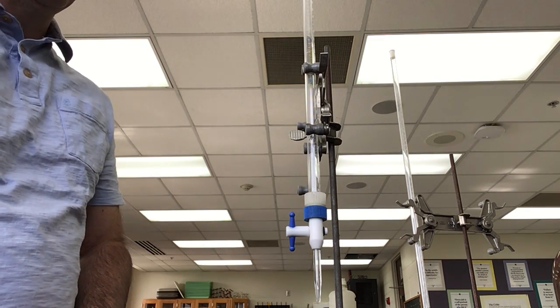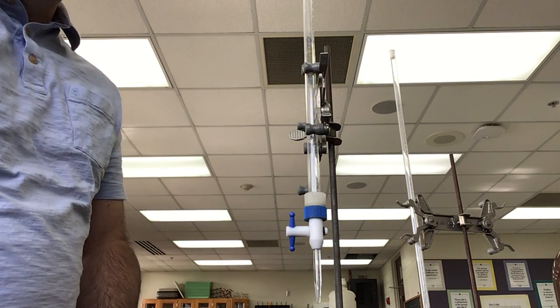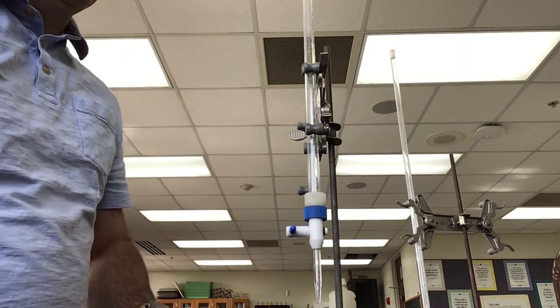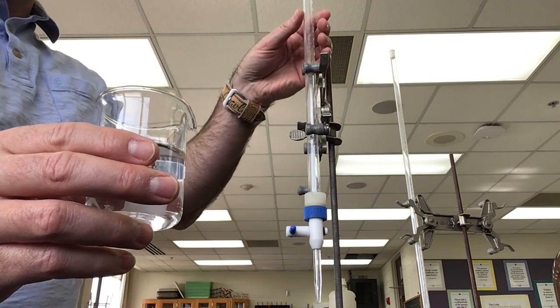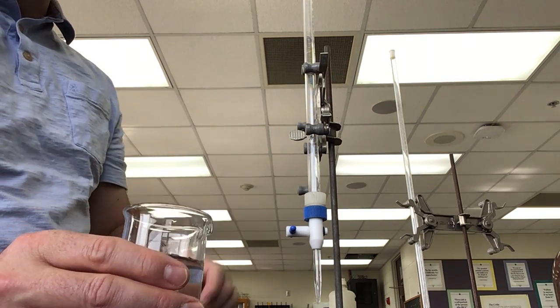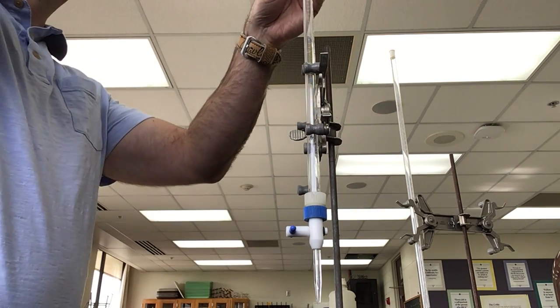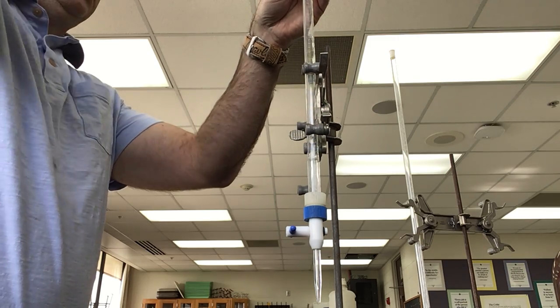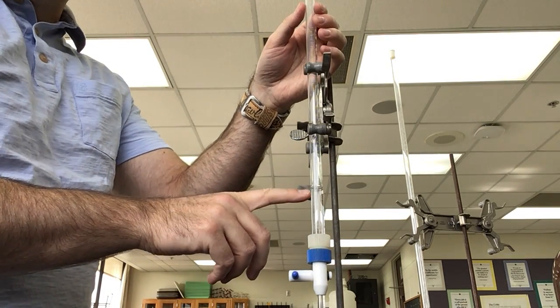All right. What we're going to do next is show you how to prepare your Buret for the titration. So we're going to go ahead and close our valve here, turn this perpendicular as closed again, and then I'm going to add a little bit of the solution that I'm going to add to my Buret, which is called the titrant. And so I'm going to pour a little bit of this in here. Lab procedure usually calls for somewhere between, say, 3 and 5 milliliters of it. So I'm going to pour a little bit of that in there. It doesn't have to be exact. So I've got a little bit of solution in here, and right now it's around this level here.